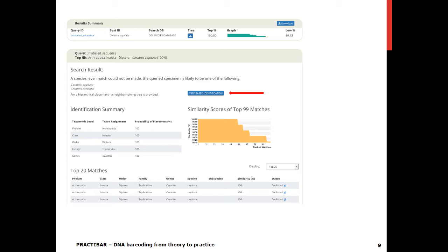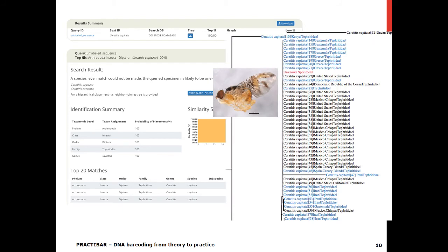So how to troubleshoot? Check the tree-based ID option. The tree displays the 100 closest matches to the query sequence, which is shown in red — the unknown specimen. In blue are the records mined from GenBank and in black the BOLD records. Then start asking questions: How frequent is the second species name in the tree? In this case, there were 12 records out of 100 identified as Ceratitis caetrata. Is it possible that there was a misidentification? Or is it a lab-related issue such as cross-contamination? Or is there a misspelling error? Are these two species synonyms? Are they closely related species that cannot be separated by genetic distances in CO1 and additional markers are needed? These are all things that you need to take into account while you follow your protocol.